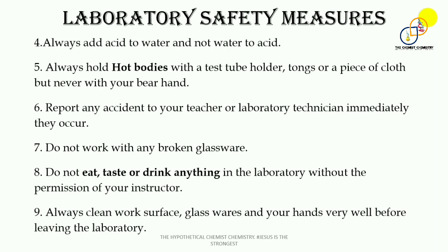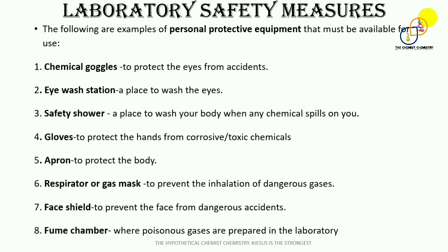Nine point, always clean work surface, glassware, and your hands very well before leaving the laboratory. That is, at the end of performing any experiment, you clean the place where you performed your experiment, you wash all the glassware that you used, and finally you wash your hands very well before you leave the laboratory.